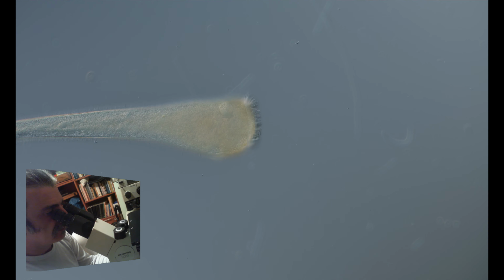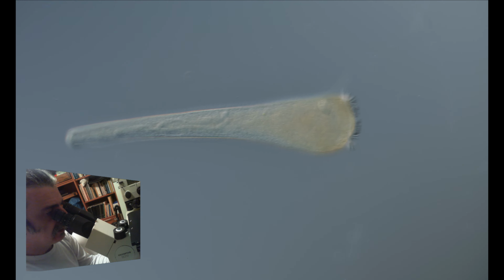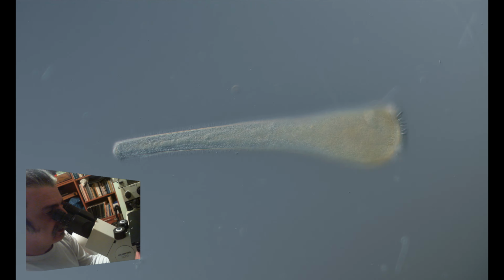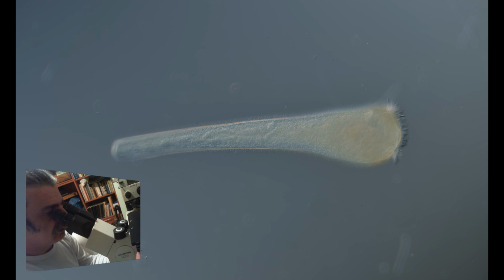And here is one of our beautiful heroes, the Stentor. Again, the Stentor is a ciliate. You can see a lot of cilia, like eyelashes, that suck prey into its mouth. And those lumps inside are actually its nuclei.